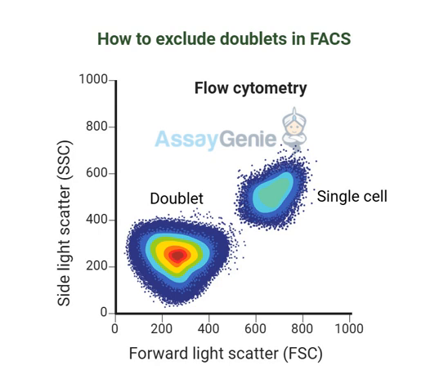Yep. But here's the thing about doublets. Being a mix of two cells, they can sometimes have mixed up colors, and that can really mess things up. So they're wearing two different jackets, and the scientists need to make sure they're not fooled by the wardrobe malfunction. Exactly. That's where another gate comes in. We use it to make sure that the fluorescent signals make sense and are coming from single cells, not mixed up ones. It's like a whole detective story, using all these different clues to find the culprits.